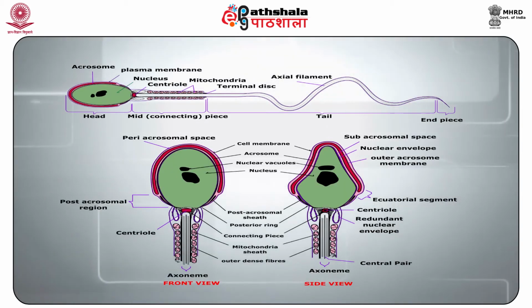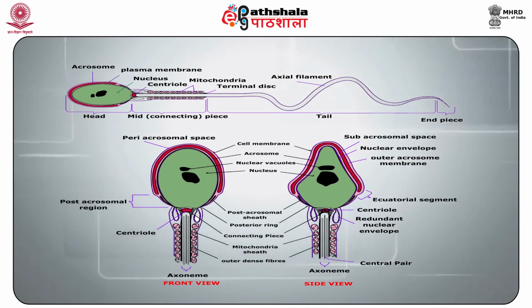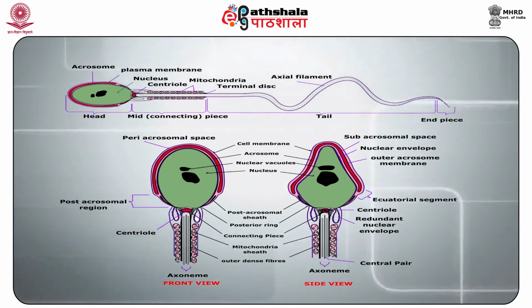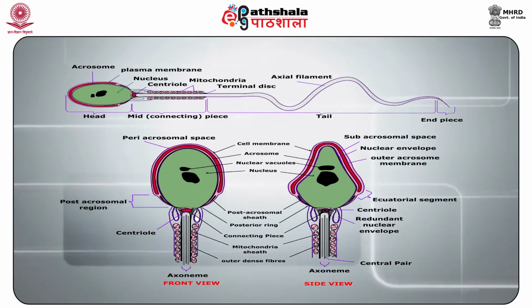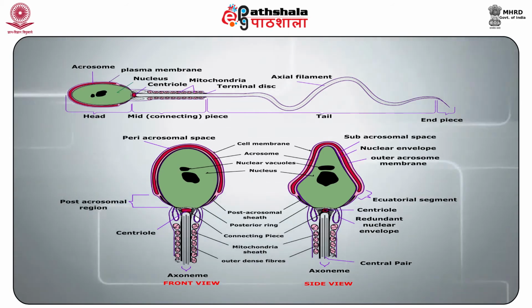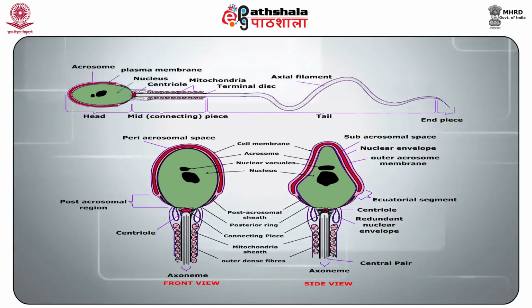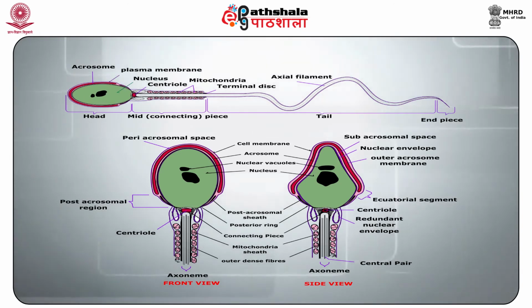Items that have been tested presumptively positive for seminal fluid using the AP test can be confirmed either by microscopic detection of spermatozoa or chemical detection of semen specific protein. Positive swabs or a small cutting from a positive stain can be smeared onto a microscope slide and then stained for visualization.